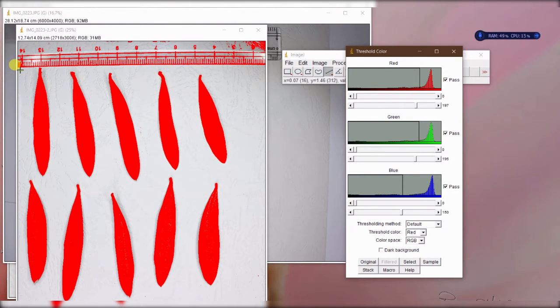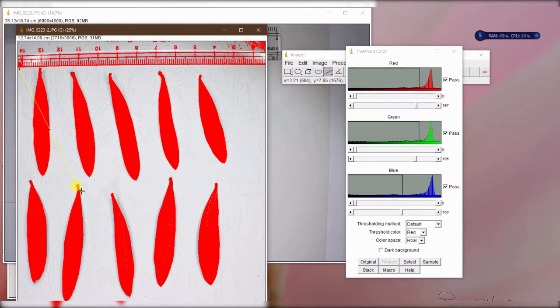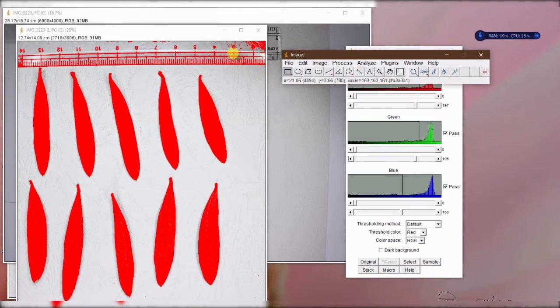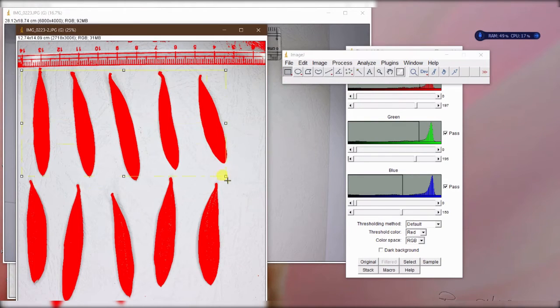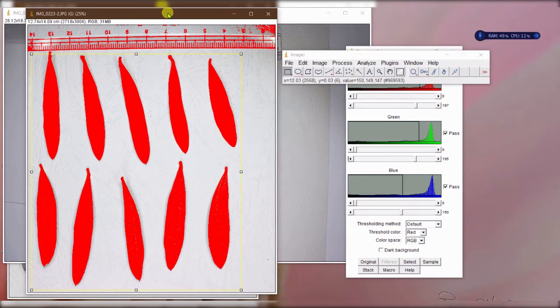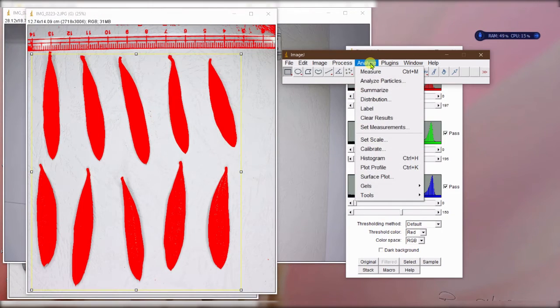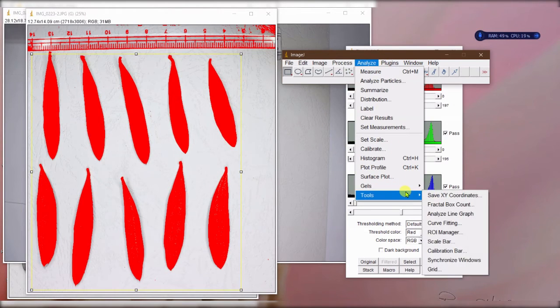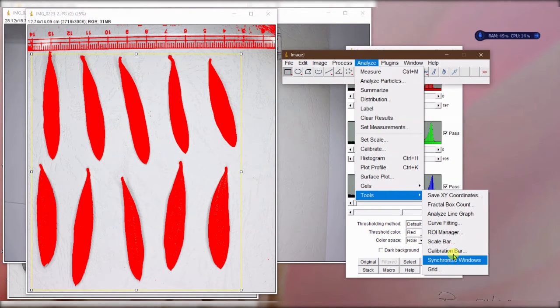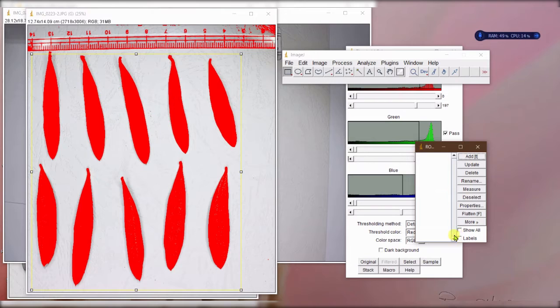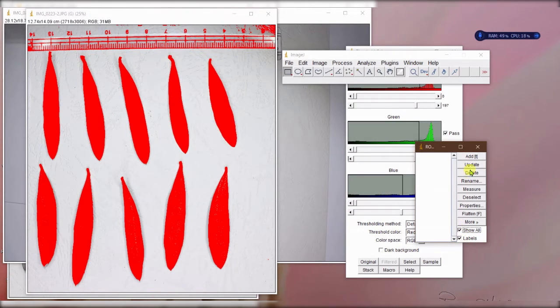What I want is the measurement of this area. I will go for the rectangle to select the image I want to measure. Then basically since I already set the scale, I can go to analyze, tools, and ROI manager. I'll click show all and labels so it will label that for me.